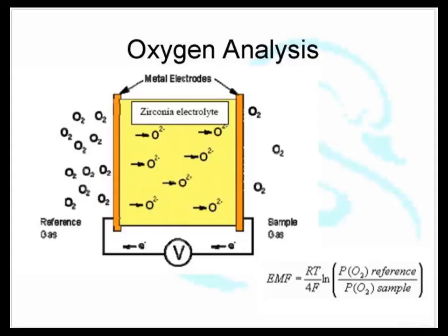It's a clear mineral, and the funny thing about zirconium is that oxygen can pass freely through it. So you build a thing called a zirconium cell, and you put pure oxygen on one side and whatever you're measuring on the other side, and you measure how many of the pure oxygens move from one side to the other.